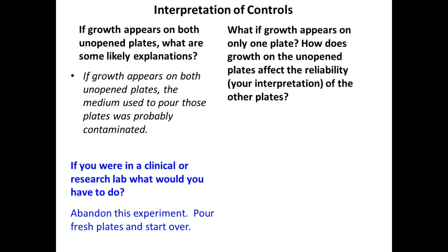Yeah, so say the 37 plates got growth on it. That means we don't know for all our 37 plates, but it puts our whole experiment into question, right? So how is it, though, that only one of the plates, the 37, grew and not the 25? Maybe the contaminant. Does temperature affect growth? Yeah, so maybe the contaminant only grows at 37. Does that mean it's not on our 25 plates?